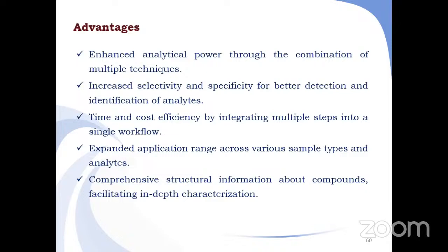Generally, the major two-step process which occurs in the LCMS is, first, in the liquid chromatography or HPLC, sample components are separated based on their interactions with the mobile and stationary phases, as mentioned in the HPLC section. Once the chromatographic separation is completed, the compounds elute from the column and are ionized at an ionization source.